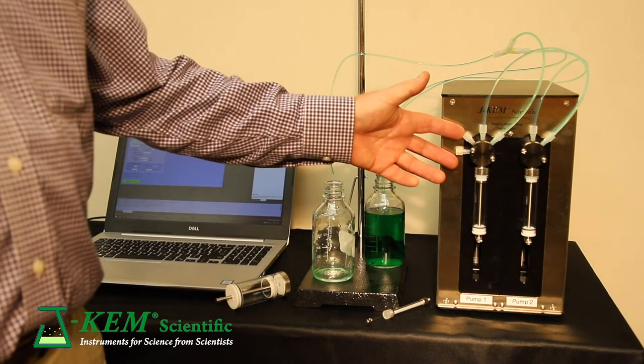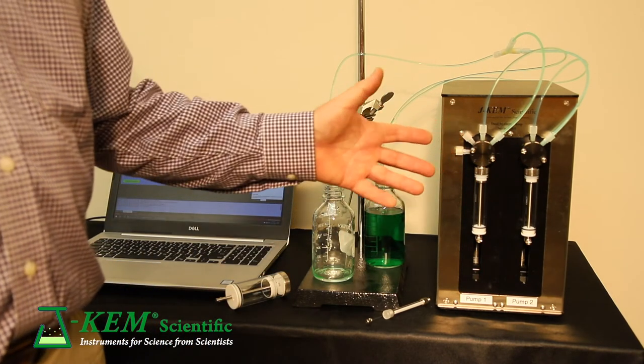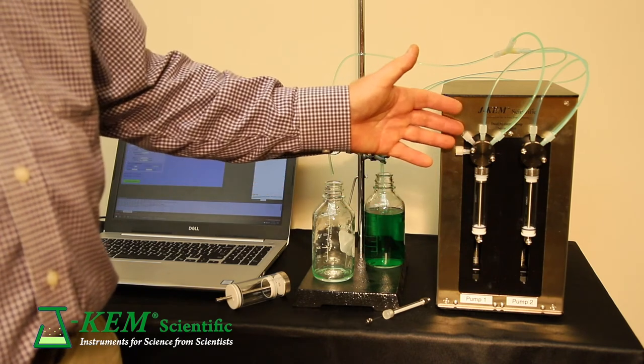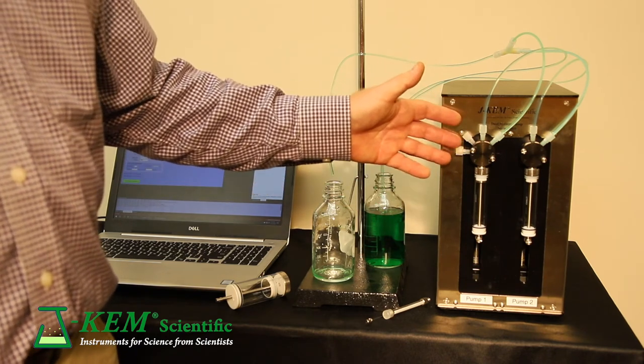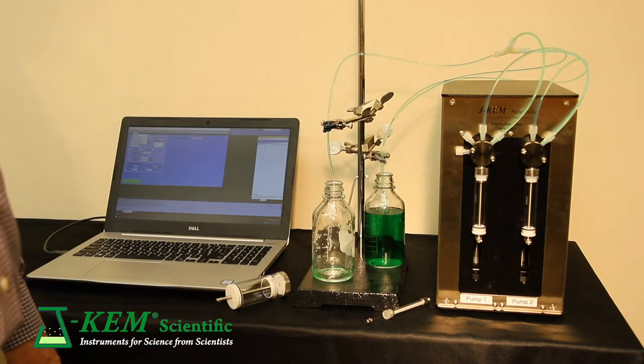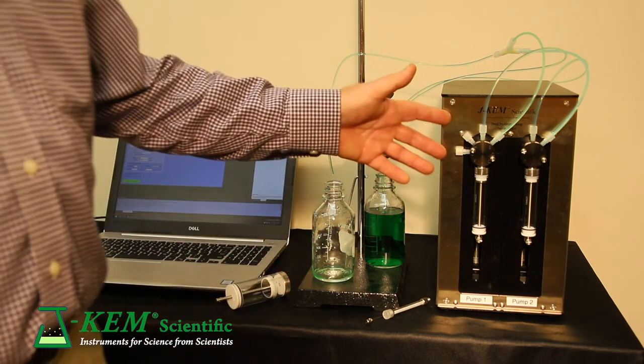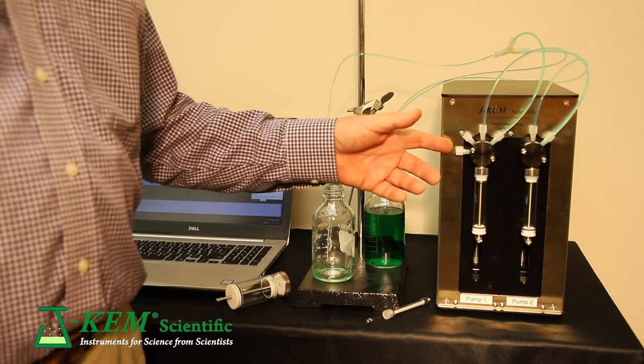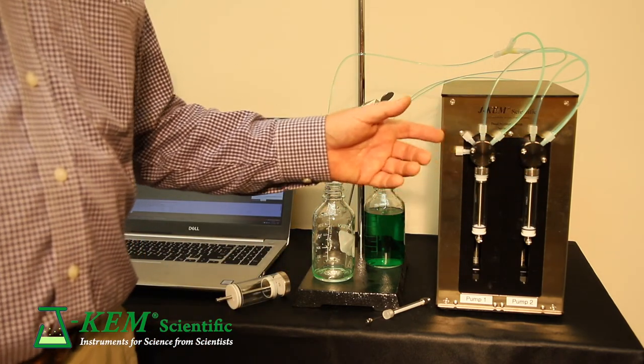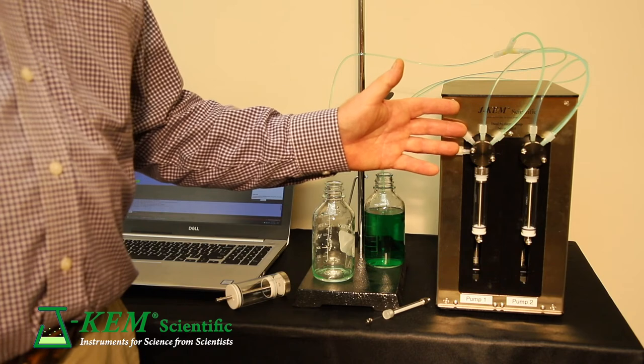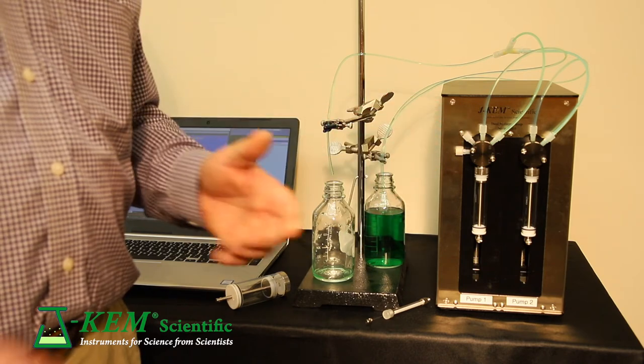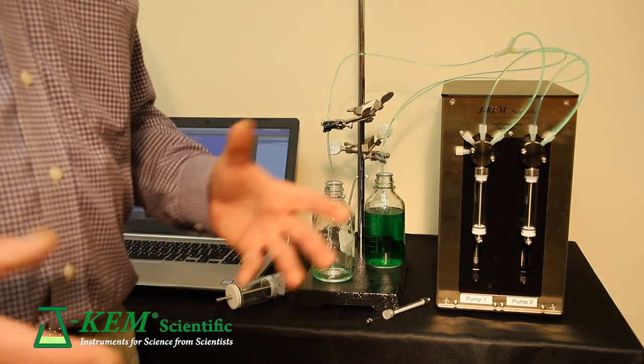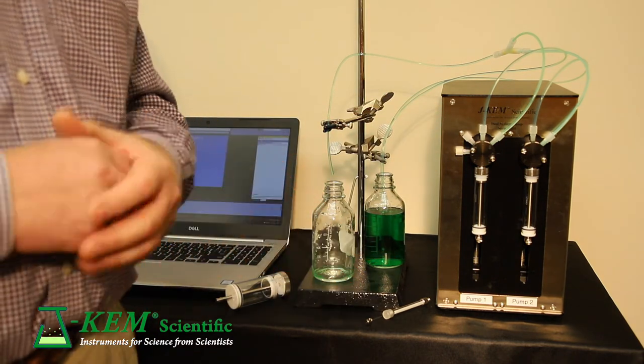The distribution valves are fully addressable by the program and they come in 3, 4, 6, and 8 positions. And what that means, since I have 8 position valves on here, is any of those 8 positions could be inlets or outlets.